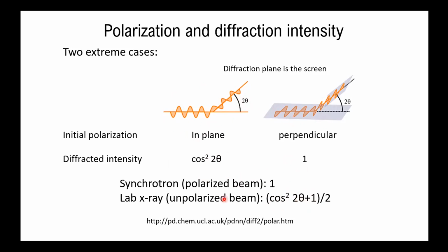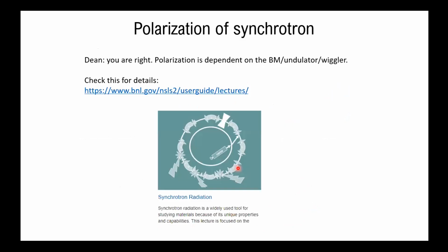And you can see this term is introducing some 2 theta dependent factor that will influence the intensity observed, right? And you can imagine when 2 theta is 90 degrees, this is a very small number. So at 90 degrees, we'll see some additional reduction of the peak intensity if the diffraction angle is at 90 degrees. So that's something very specific to X-ray diffraction, and maybe something not intuitive, I think. And like I said, you can check this website, and they have a more detailed description. But the ideas are, I think, something I present here.